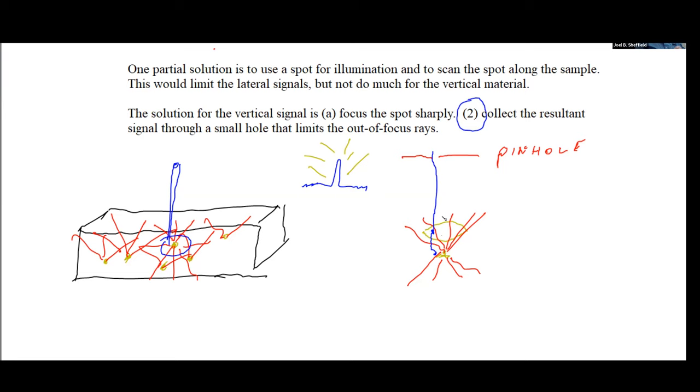Supposing now I send the light, the resultant light, up through that hole itself or a similar hole. Turns out to be the same hole that's in exactly the same focal position. So the fact that you have one object in focus through this and the other one coming back up through the same thing is what people refer to in the term of confocal. Which means it's in focus, both the illuminating light and the emitted light or the transmitted light are in the same focal position.